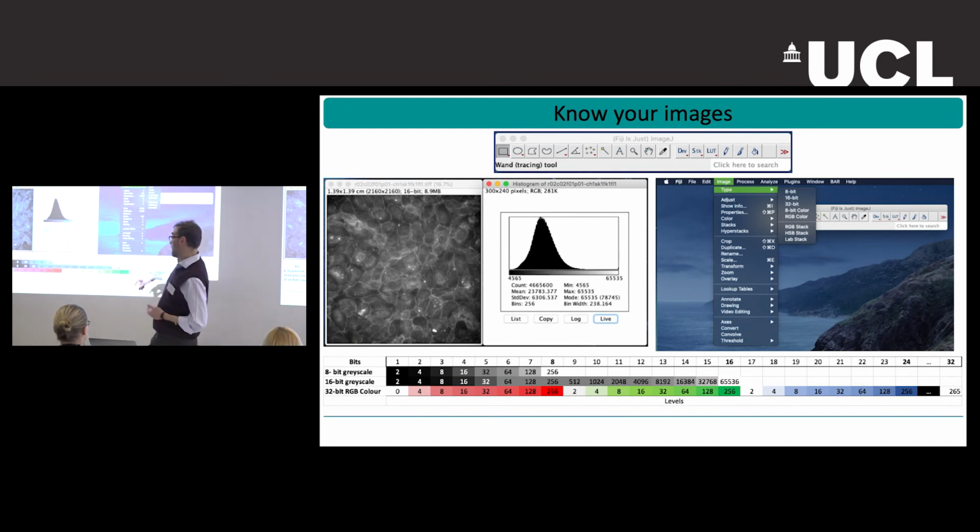Okay. The last thing out of this slide that I would like to say, another very important thing: when you work with fluorescence in particular, take a very close look at what your image is. Because if you export from your software an RGB image, the composite, the nice-looking one like the first image I showed you with orangey and green dots, and you export it as a single image, this might not contain all the information you need.